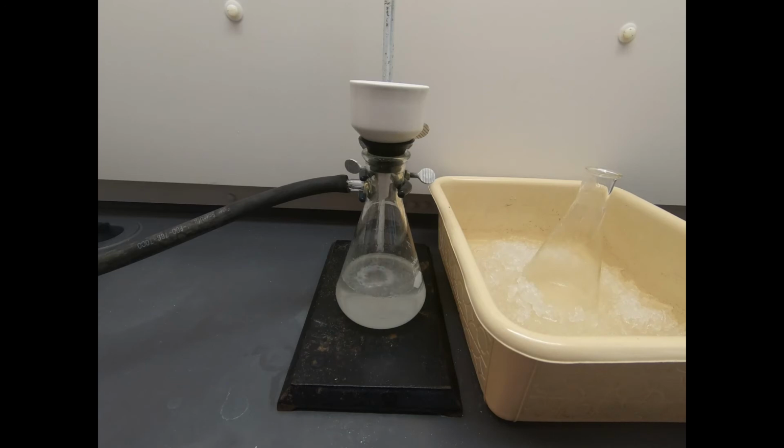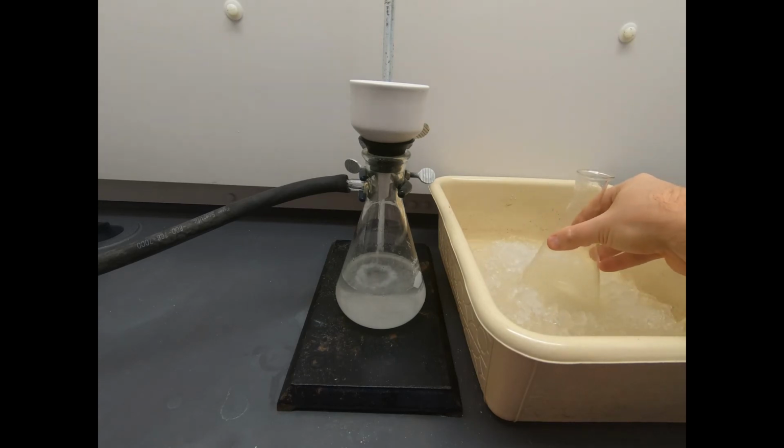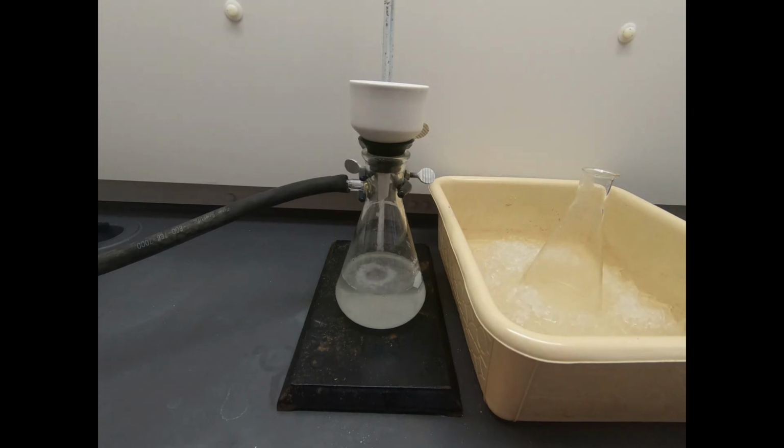So again, we're dripping away. Now, what's going to happen when this finishes? Well, we do want to give this a little bit of a rinse. And so here is our solution. I'm going to put just a little, since this is slow, I won't do a ton of rinse. But we'll swirl around a little bit of that cold clean solution into the flask. And now once this dripping stops, we'll just give it a little bit of a wash with this solution.